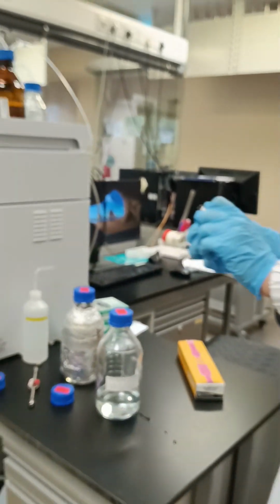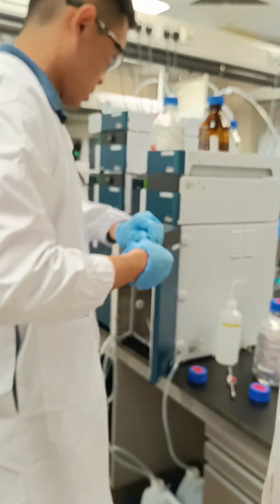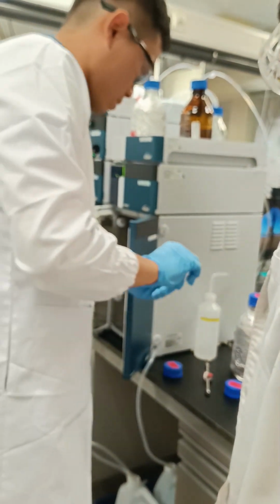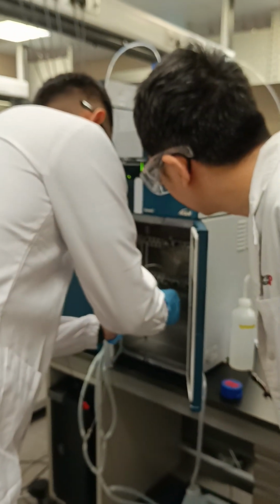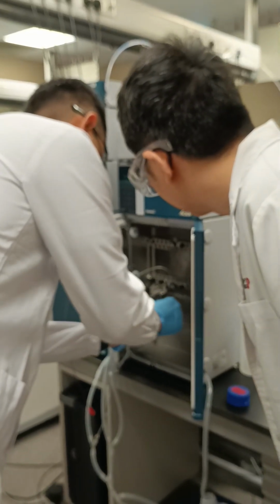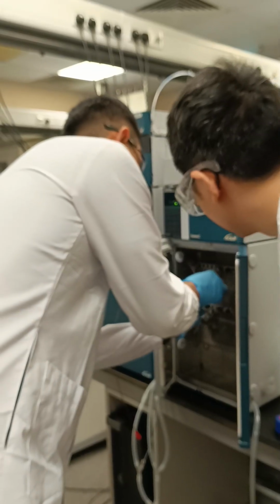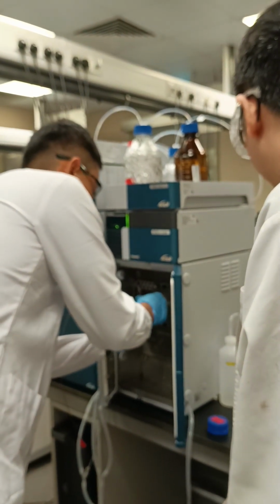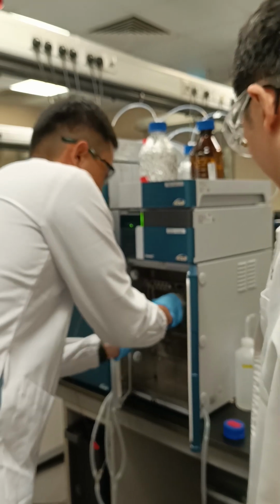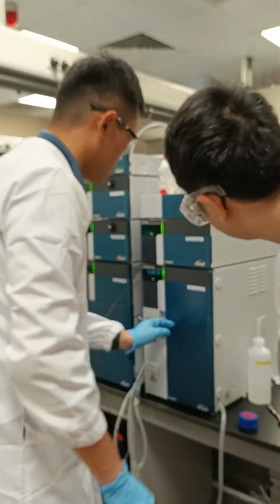Usually when we do purging, you can remove the column, up to you. It doesn't really make a difference, but I'm showing you how to do it without the column. There's this nut, you just connect it instead of using the column. Sometimes people worry that the flushing might cause damage to the column. But so far I've done that and I don't see any damage, so I never really bothered to change it. But this is the proper practice that you guys should follow.